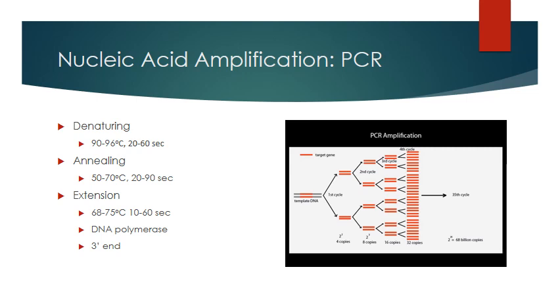In the second step, you're going to have two oligonucleotides that are going to prime the synthesis of DNA and anneal or hybridize to complementary sequences on the template. This requires that you have the primers for the sequence that you're interested in. Those primers will dictate which part of the DNA will be amplified. You don't have to amplify the entire template DNA. It's just the one gene that you're interested in, okay? So it's the primers that will determine the specificity of the amplification.